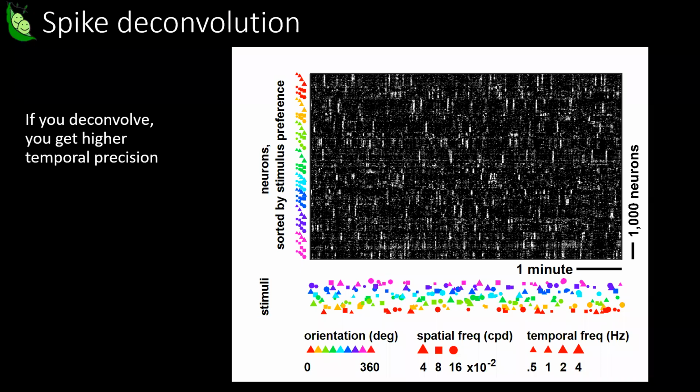And if we don't deconvolve, then our traces will bleed into the responses for the next image. So if we deconvolve, we kind of remove this bleed through, and we actually improve our signal variance. Our responses are more reliable to these visual stimuli if we deconvolve rather than not deconvolving. So I recommend looking at your deconvolved data, at least, and considering doing analyses on that. There's also a temporal baselining step that happens before deconvolution. So it generally is better to use the deconvolved data.